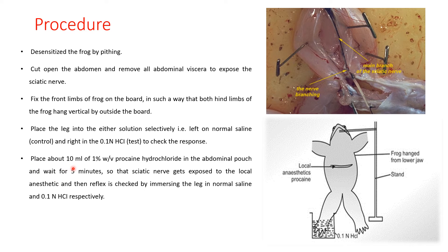Now place about 10 ml of 1% weight by volume procaine hydrochloride in the abdominal pouch. We have to put the local anesthetic here through the pouch and wait for 5 minutes so that the sciatic nerve gets exposed to the local anesthetic. Then the reflex is checked by immersing the leg in normal saline and 0.1 normal HCl respectively.